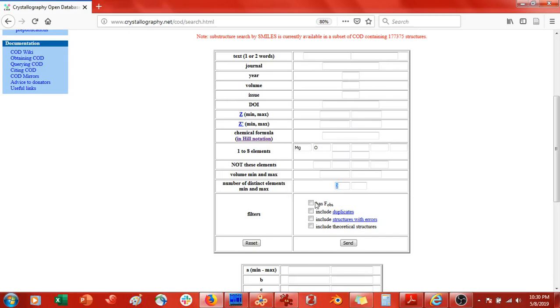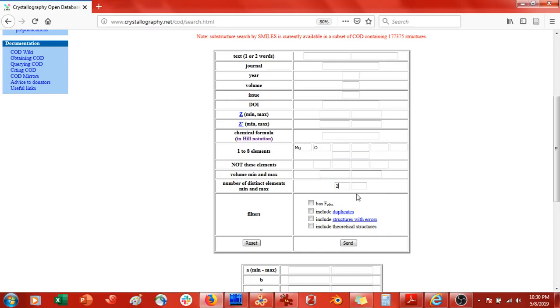If you didn't put a two here and left it blank, it would give you all crystal structures that contain magnesium and oxygen — not just binary compounds. Basically, you want this number to match the number of elements you put in the search. If you leave it blank, it shows all crystal structures possible that contain magnesium and oxygen. So we're going to put a two here.